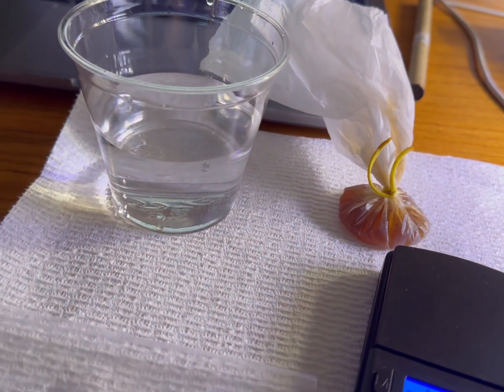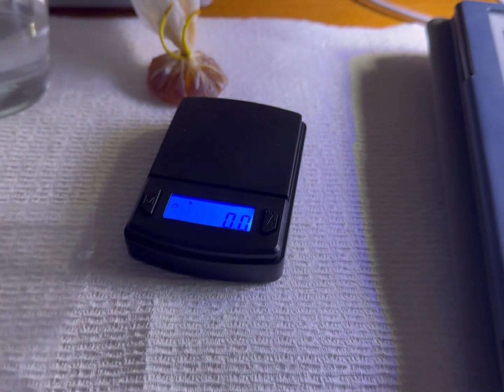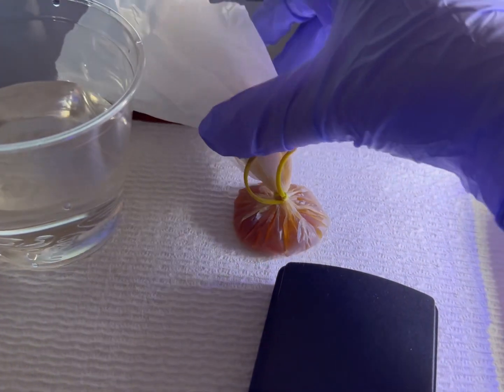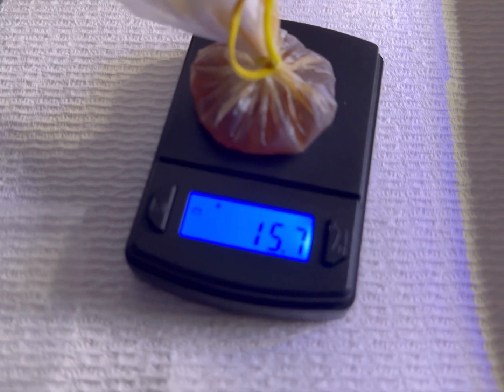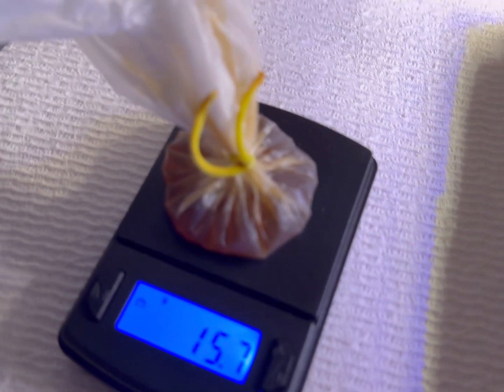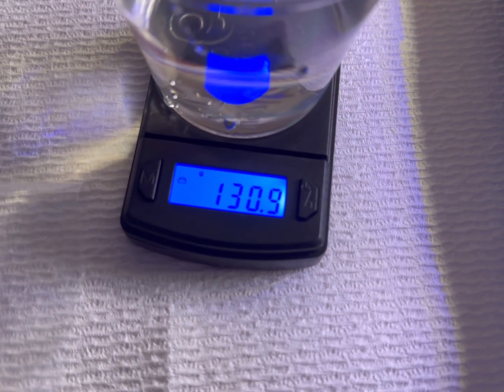So in our first experiment, we have a cup of distilled water and some corn syrup, and we'll weigh it on this scale. So let's do the corn syrup first, and we'll put it on our data table 1. So that is 15.7 grams. And now we're going to do the cup of distilled water. So that is 130.9 grams.